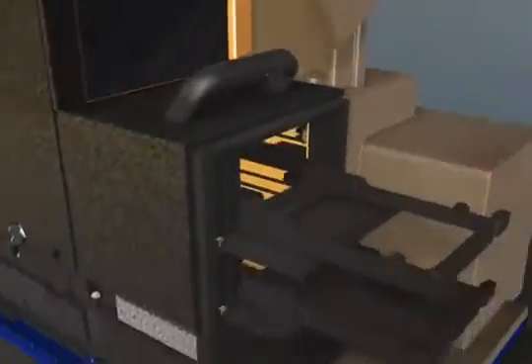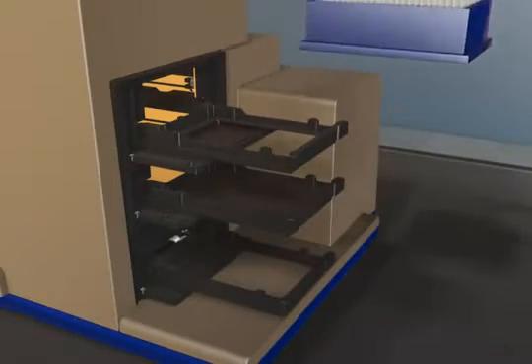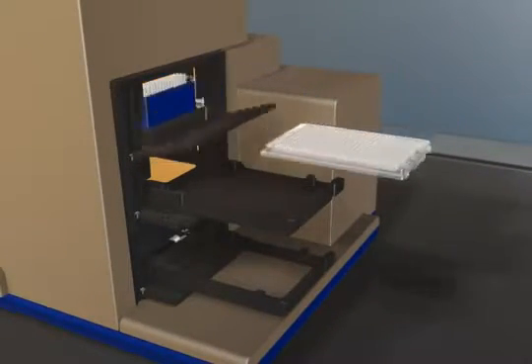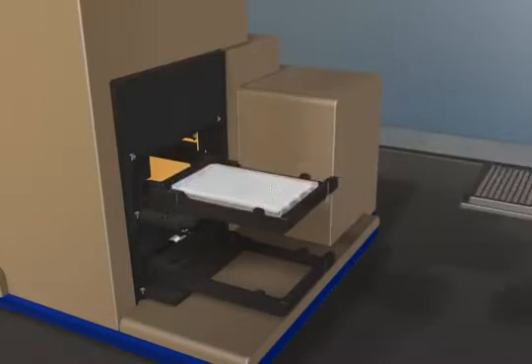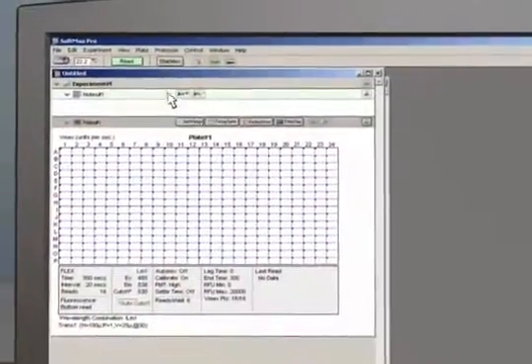To run an assay with fluidics, simply load tips, a compound plate, and your assay plate, then click read in the Softmax Pro software.